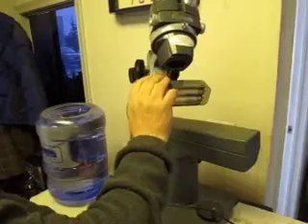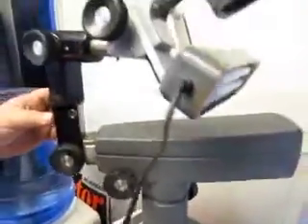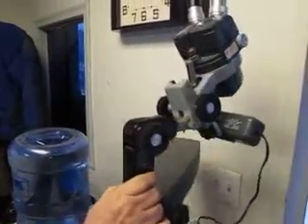They claim that it's functional — that's what it is. Look at our pictures. Good luck bidding; any questions, give us a call — our number and email are in the ad. I can crank this up; you can hold the camera and I can just turn it. Pretty neat.